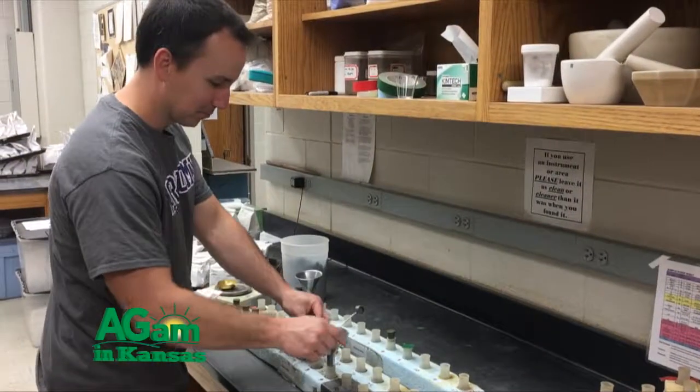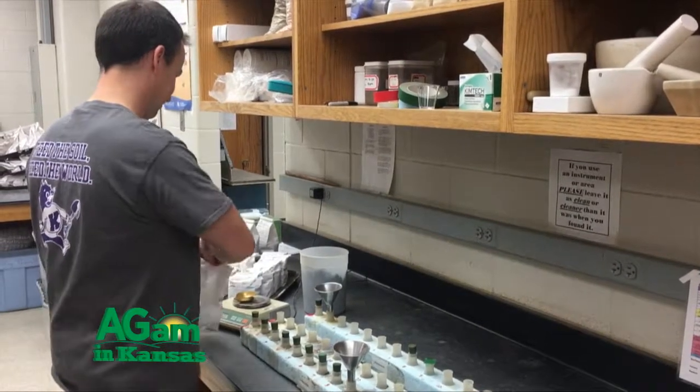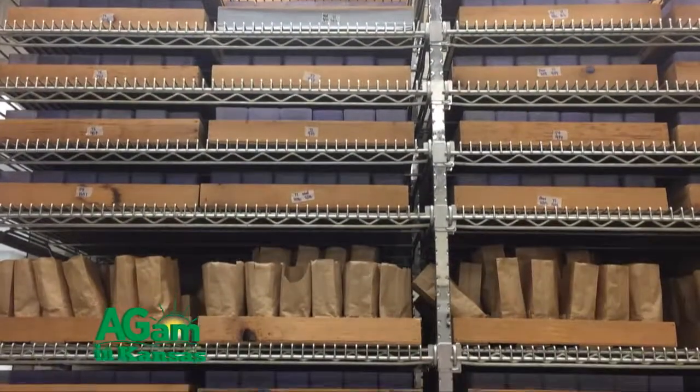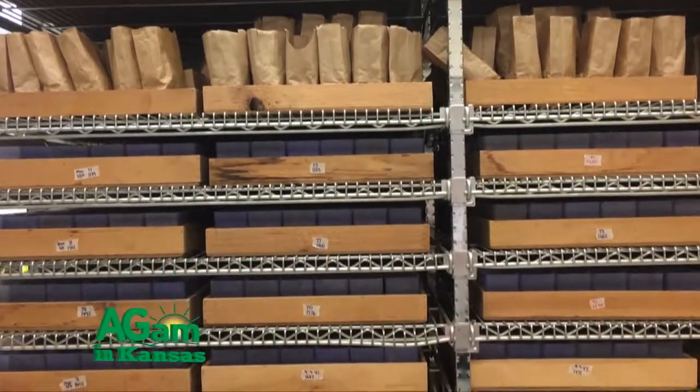I want you to define that correlation, calibration aspect you just mentioned there. So if someone from Texas sent you a soil sample, what do you do? Yes, again, our recommendation is specific for Kansas. So the way we develop that is, like I say, with research, and research has been going on for many years at Kansas State University. And that correlation calibration basically means that we are evaluating the soil test in terms of what kind of response we are seeing in the crops, both nutrient uptake and yield response. So when we have a number, say a soil test phosphorus of 20, we know what that means for our crops, for our conditions here.